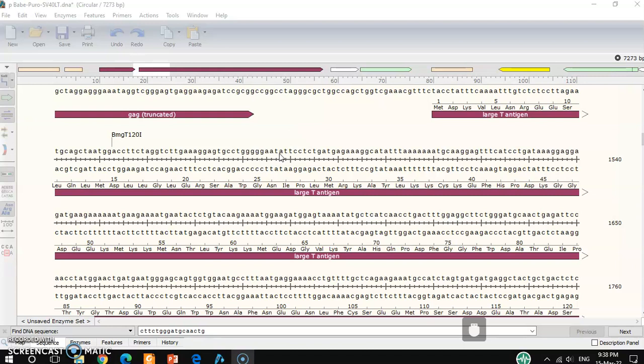In my last video I already showed how to make the primers for normal amplification, and in this tutorial video I'll show you how to make the primers for the addition and deletion mutation. And in this video I'll show only the small fragment deletion and addition. Maybe later on I will show another video for the large fragment, how to make the primer for the large fragment deletion and addition. So let's move on to the tutorial part.